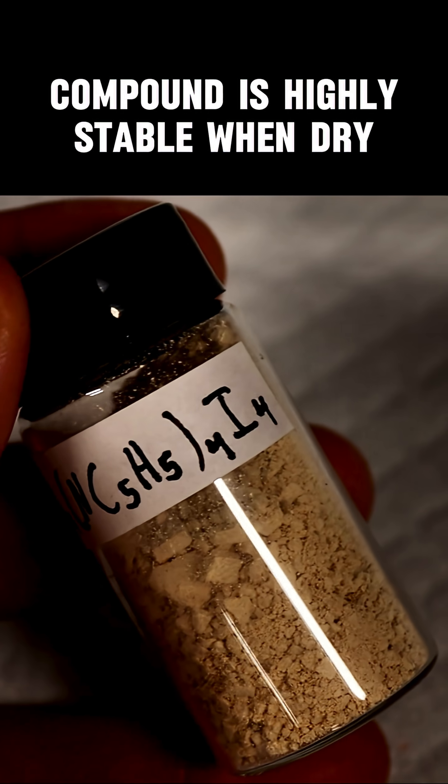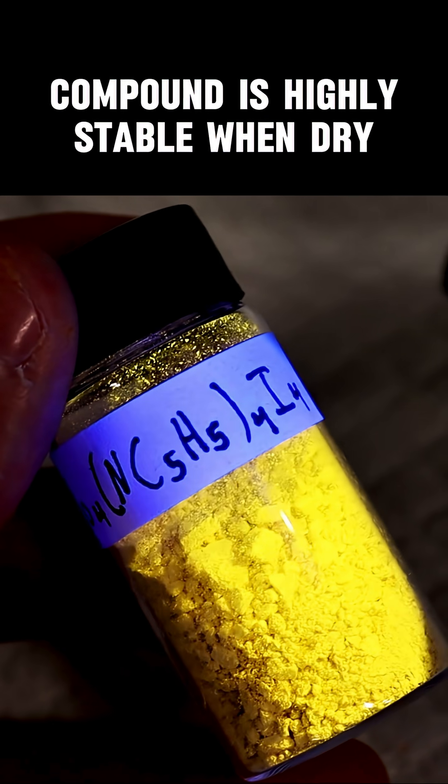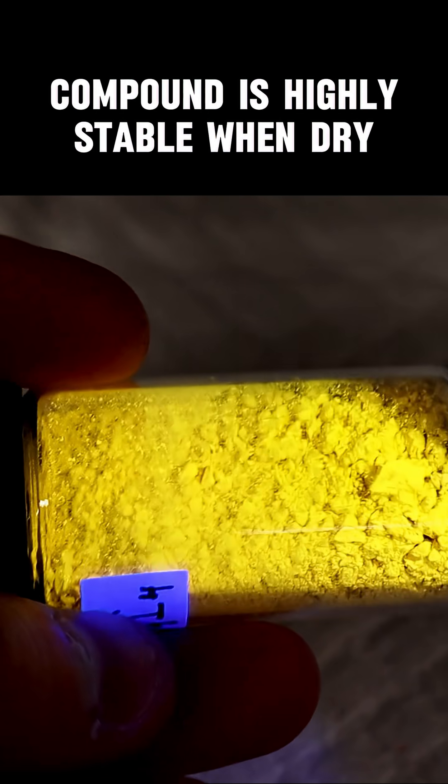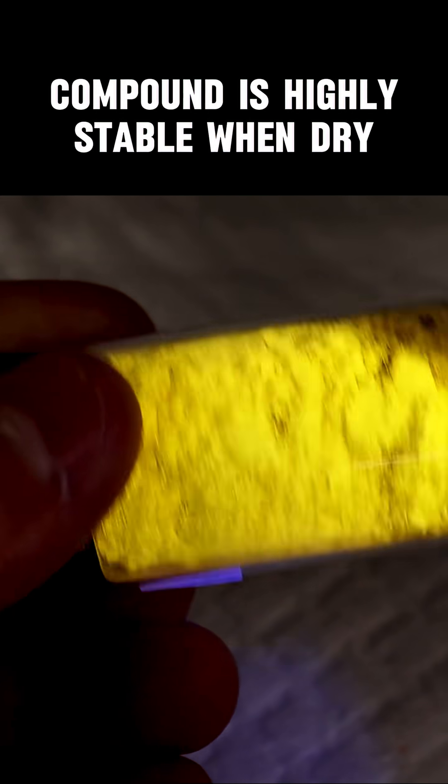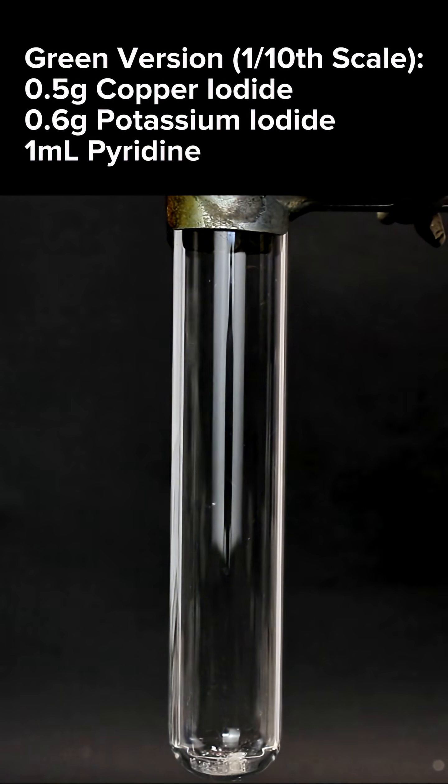You can also make a green variant of this compound that isn't nearly as stable but also looks really cool. It can be made basically the same way as the yellow variant, except this time I'm doing it in a test tube at about one-tenth the scale.